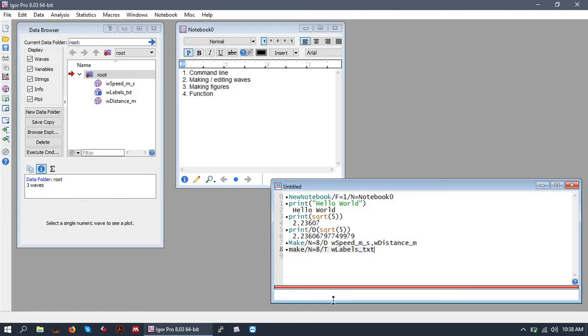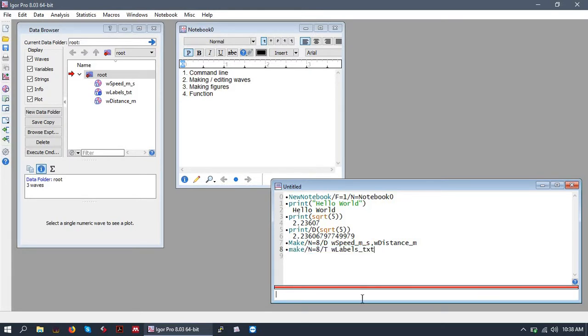I highly suggest making your waves from the command prompt unless you really don't like to type because although this might seem slower, I suppose when you're making like five different waves, it's a lot easier just to type it out. But again, personal preference.